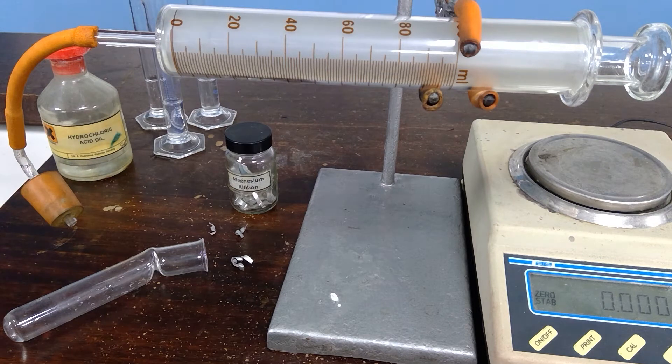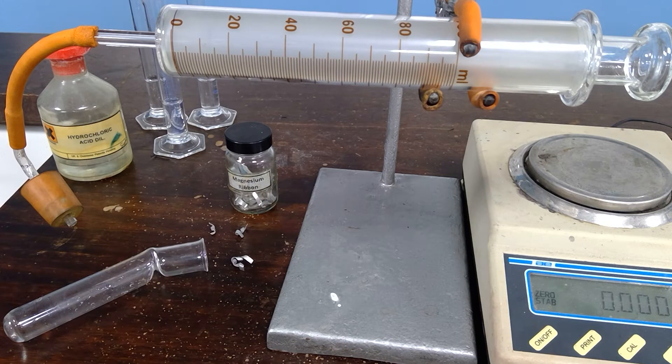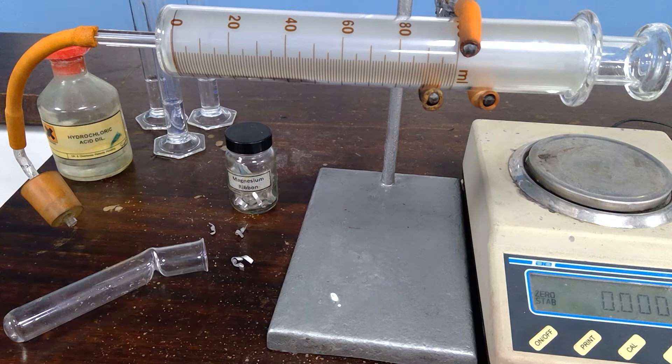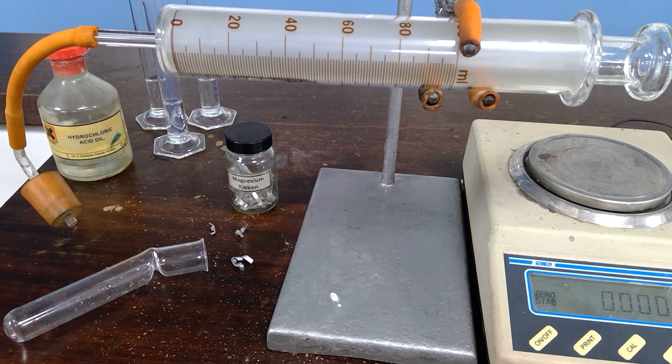The volume of the hydrogen produced should be recorded at the end of each experiment. Although the gas syringe says milliliter, you should be recording cubic centimeters, cm cubed. Let's start then with the first smallest piece of magnesium.